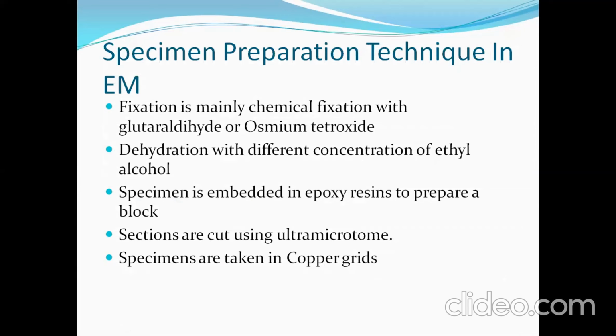First, you have to take a slide which is grease-free in nature. Then you have to prepare a smear, then air dry, then heat fixation, then application of certain stains, and then washing, finally air dry and observing, right? So these are the normal methods which are used for any type of preparation in the light microscope.